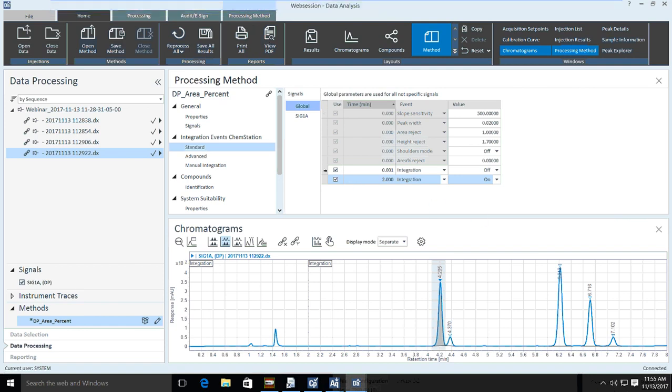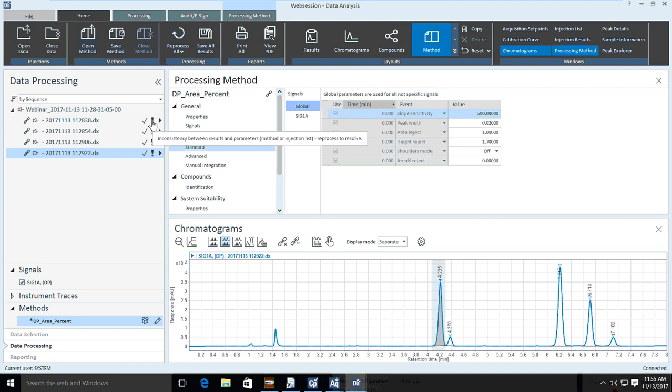Now what if I don't want these anymore? I can actually highlight these, right-click, delete events, and they're back there. This exclamation point pops up because now I've got to reprocess because I removed a change. All right? And so now they're back on their check, all right?